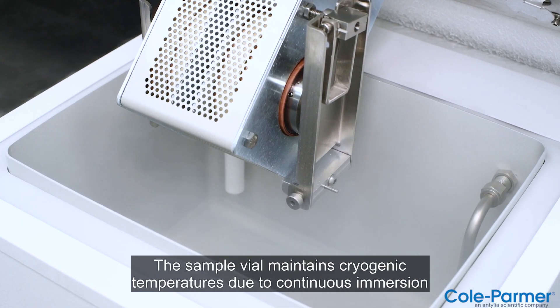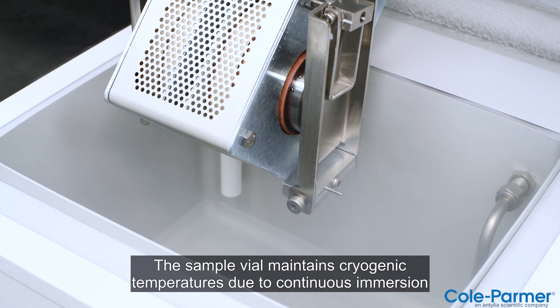The sample vial maintains cryogenic temperatures due to continuous immersion in liquid nitrogen.